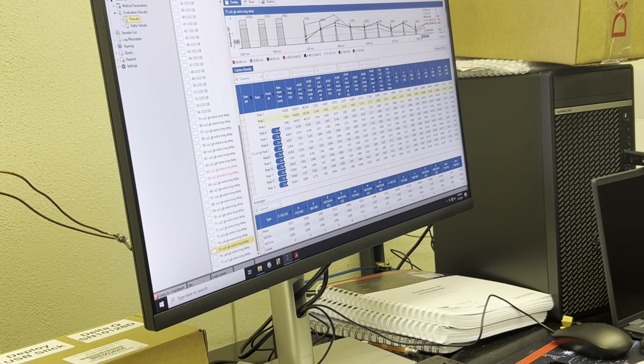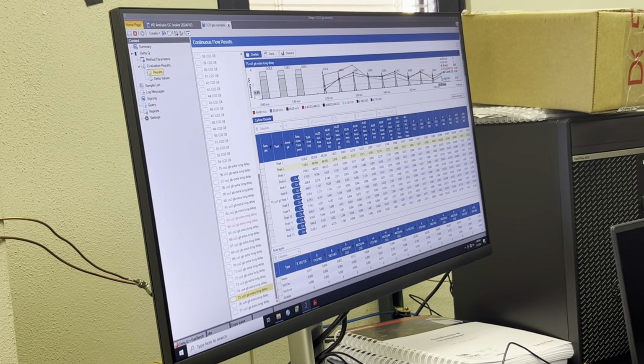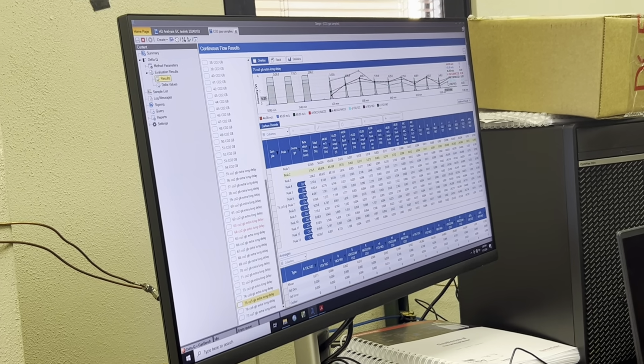The correction for the samples will be against your reference material, which you will treat in the same way. Assume the fractionation occurs in the same way.